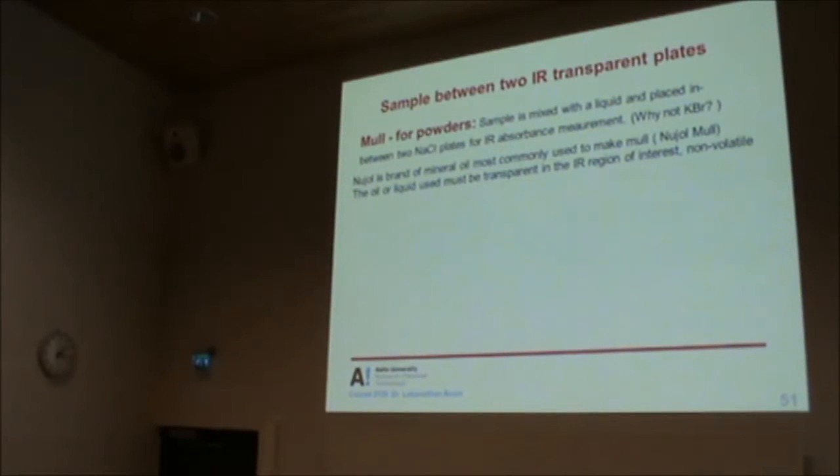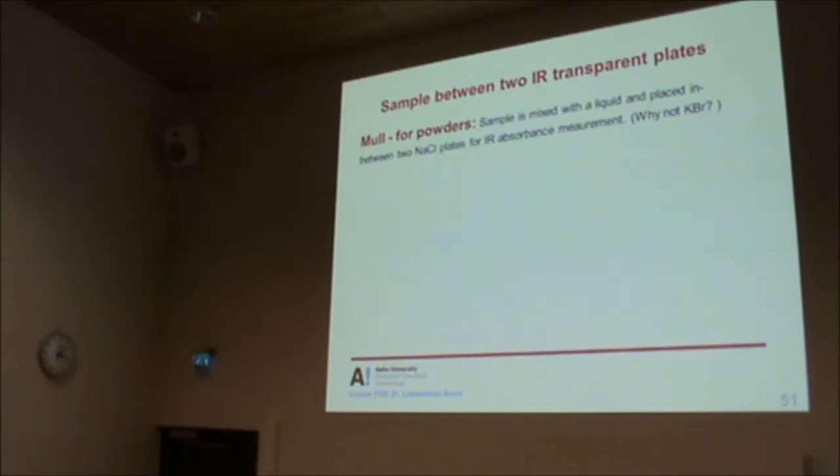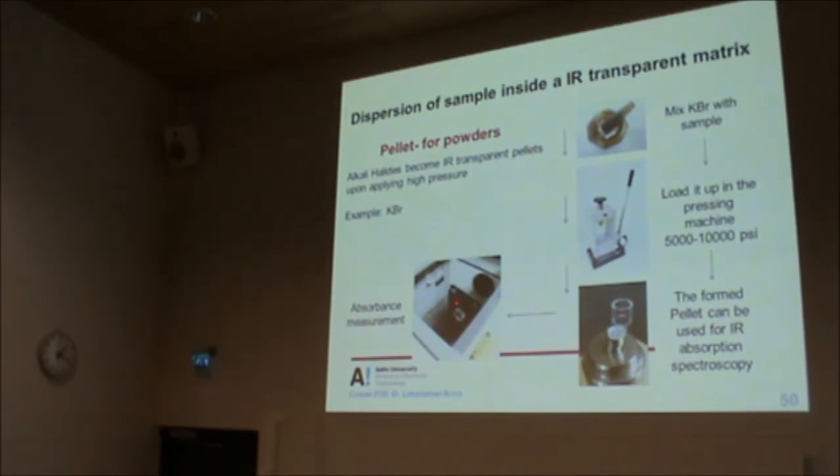That's the original name. So now what you do is you take the sample, you mix it up with a bit of mineral oil and form a paste, and then you put it on a sodium chloride plate and you spread it, and then you sandwich it with another sodium chloride plate, and then you put that in here, in this place.